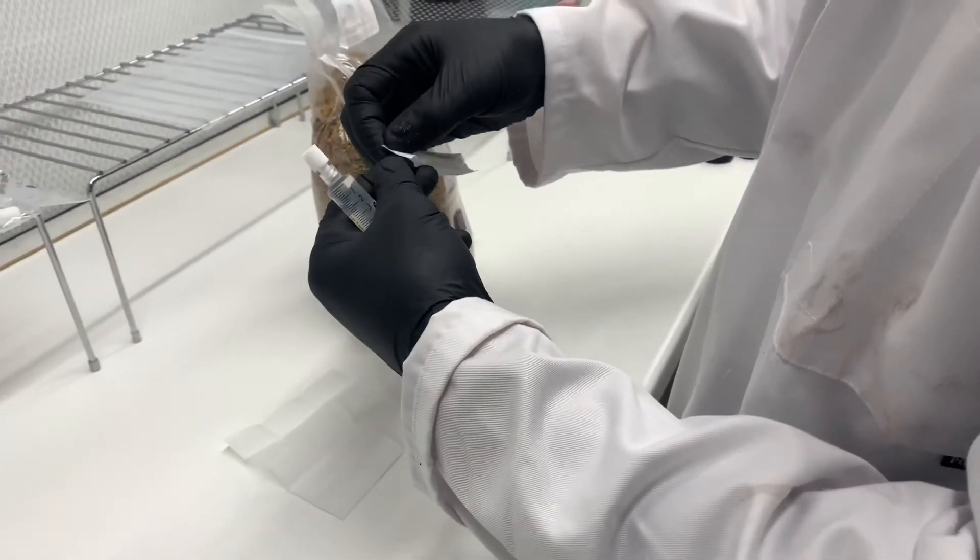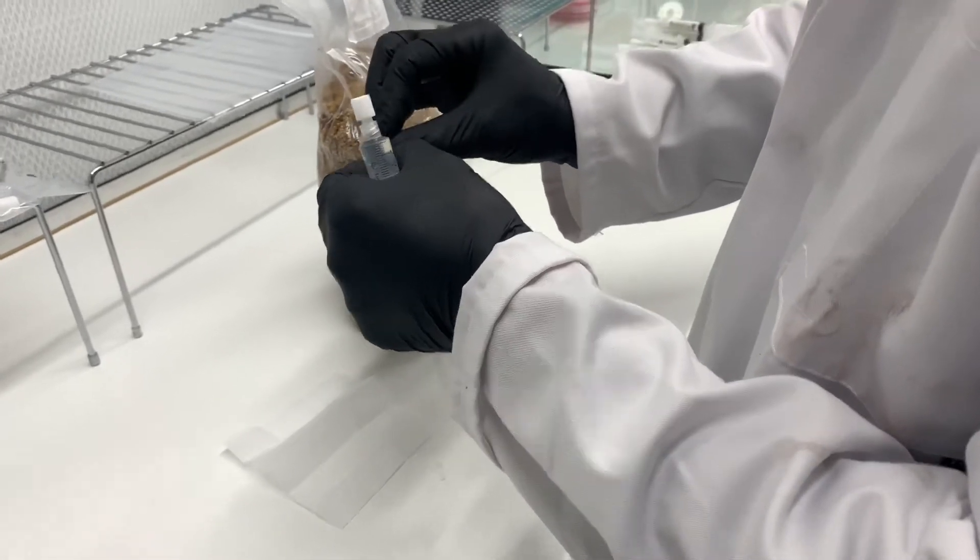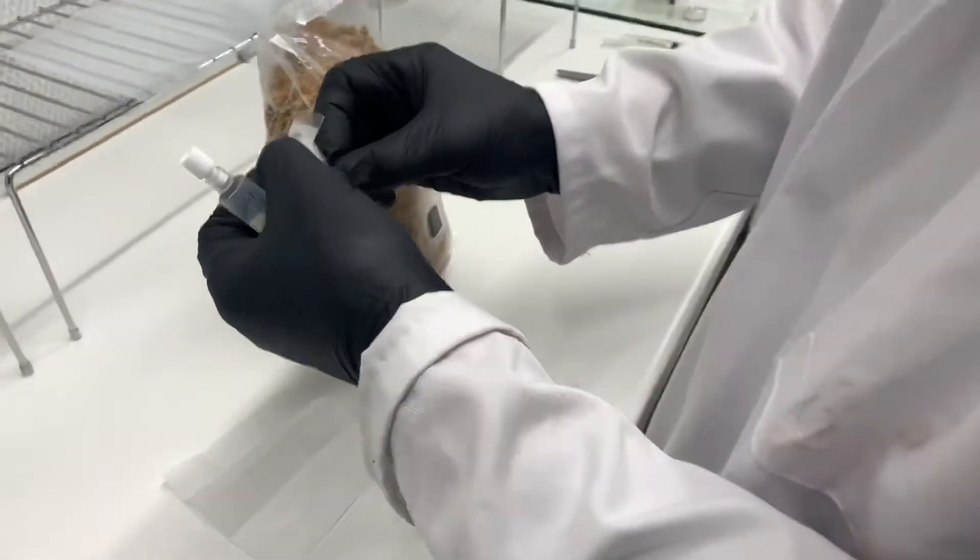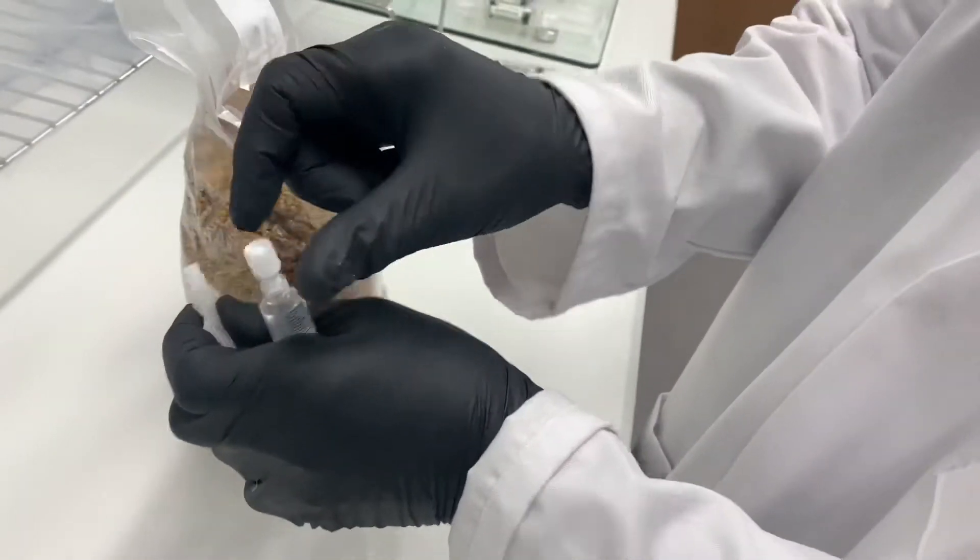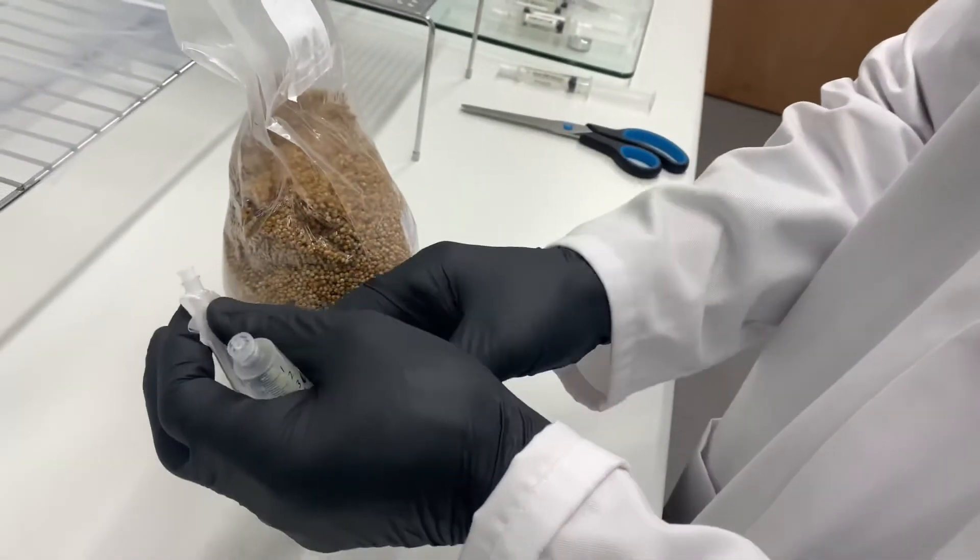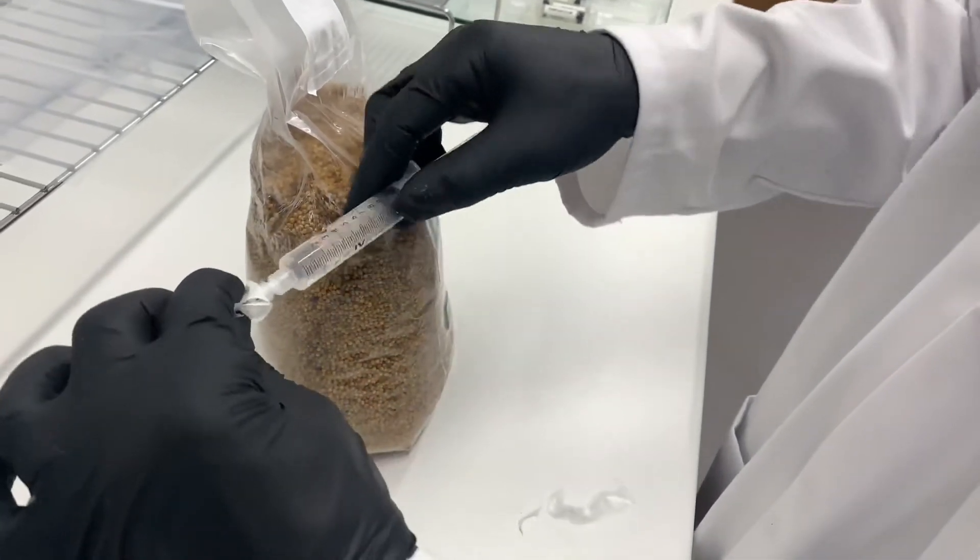All right, so next up we're going to unwrap our needle. Needles come sterile and individually packed, so you just open them from the tab end without touching the needle nozzle with your fingers. You're going to screw it into the luer lock.